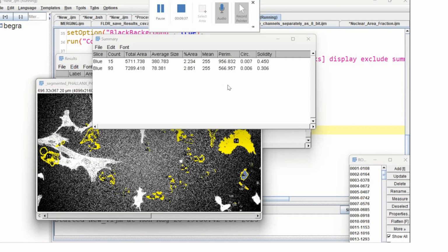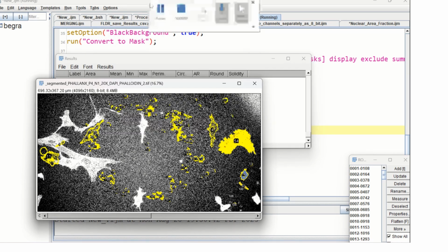Okay, so you can see, sorry about my dog. So you can see that it's doing everything for me. Here's my summary tables. Sorry. Boba, can you stop? Okay, so you can see my summary tables. You can see, let me let her out.